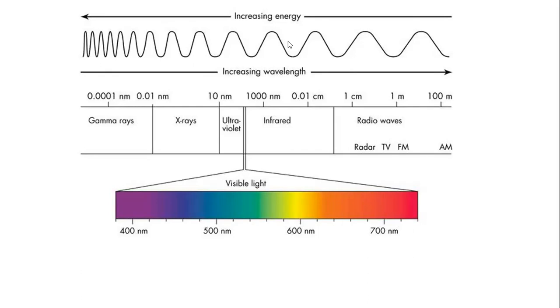This process is referred to as absorption, when the energy of light gets transmitted to the energy requirement of an atom, and the electron goes to the next electronic energy level. This process is called absorption.